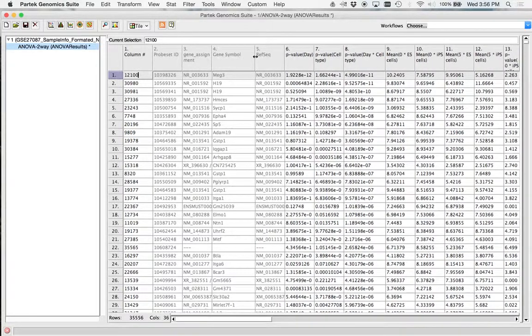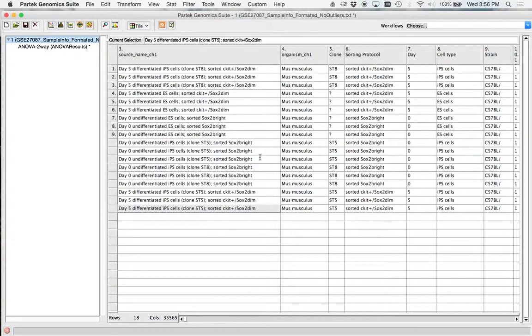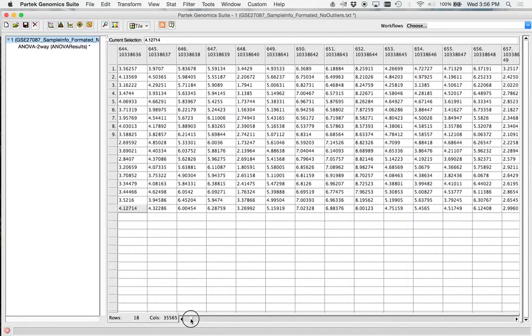So when we attach the annotation file, if you look at your original column, here are gene names. Wait a minute. All our Affymetrix, instead of putting gene names, what it does is put a number because it makes life easier for them. Because they can put a different number for the same gene on different arrays and keep them separate.